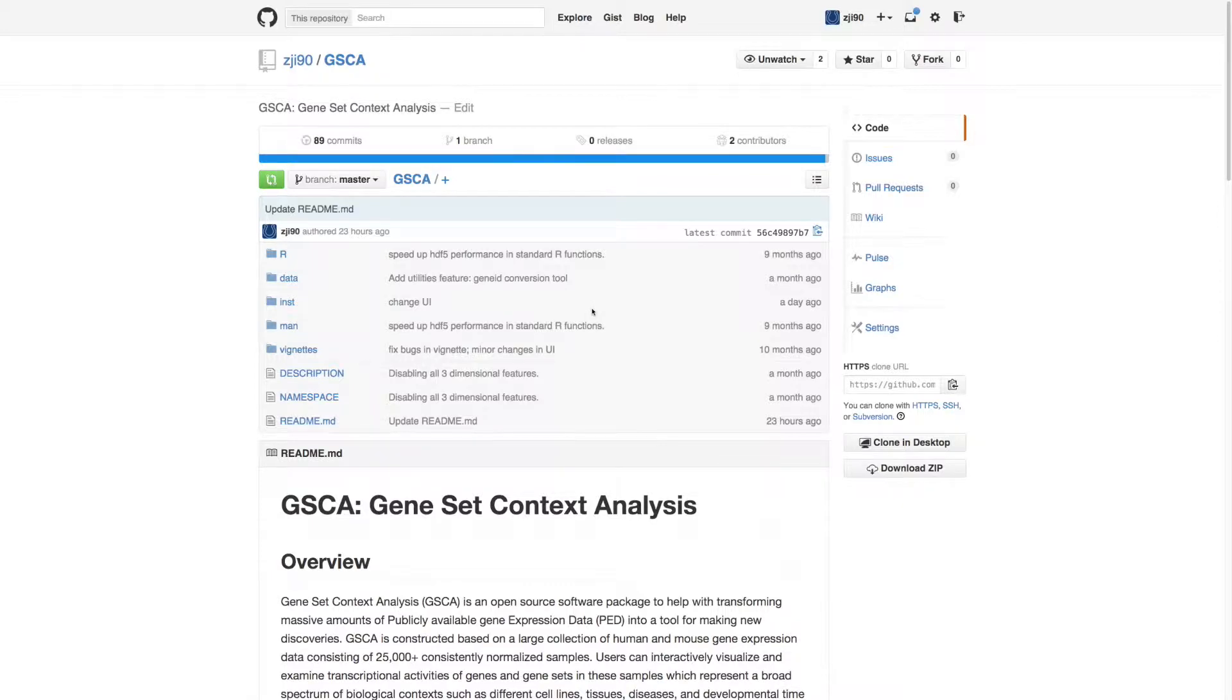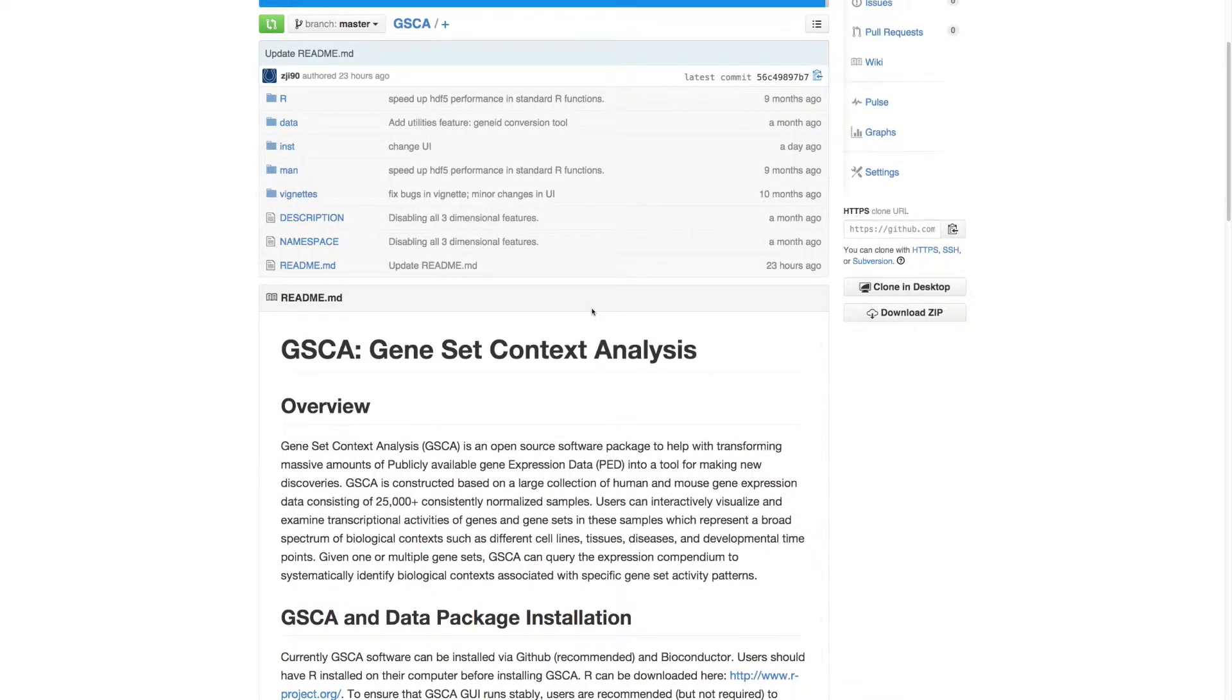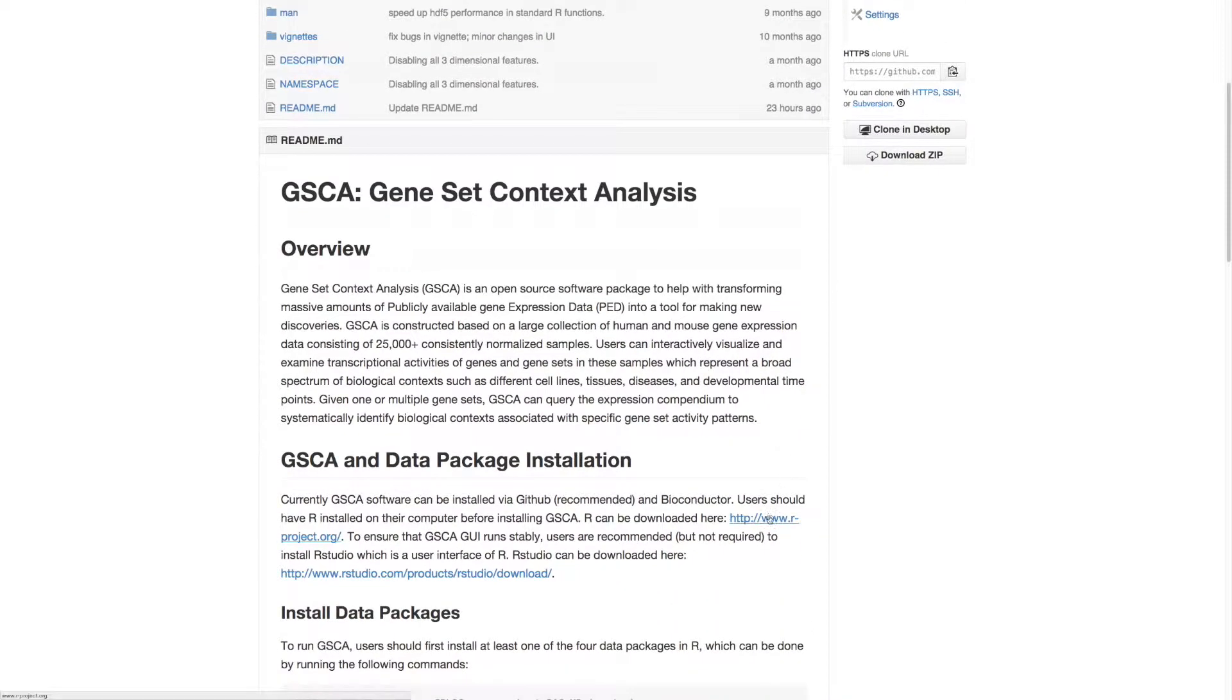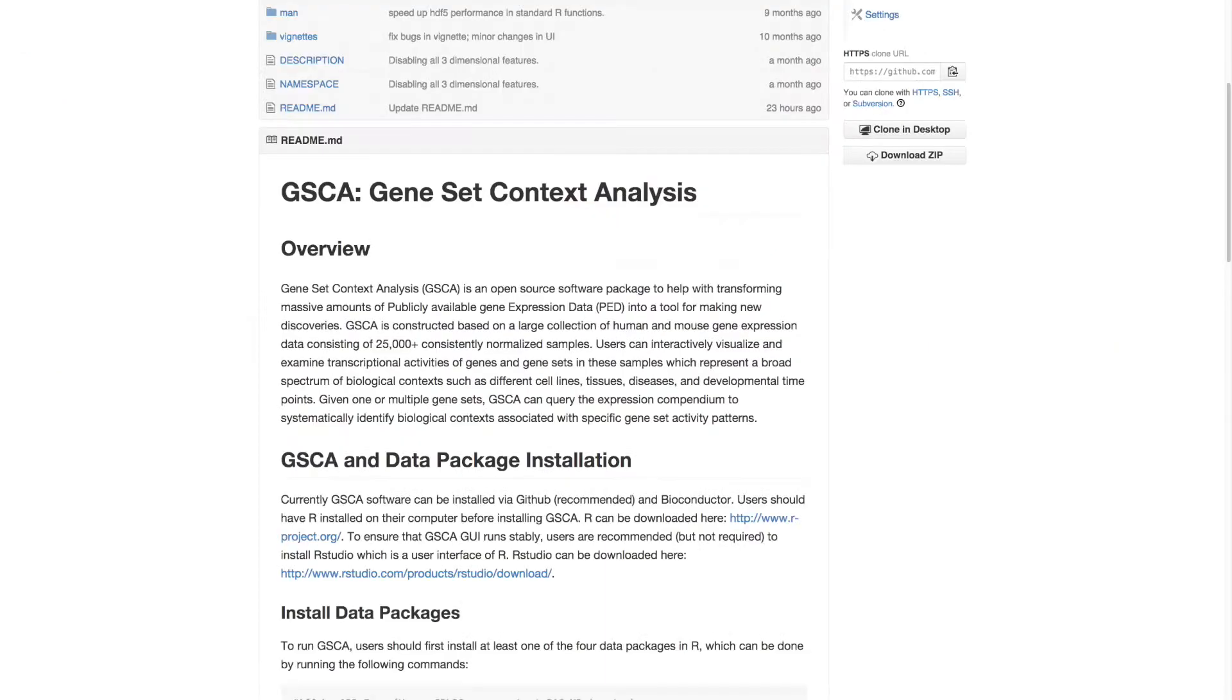To install GSCA, you should first download and install R from our project. It is also recommended that users install RStudio before running GSCA.